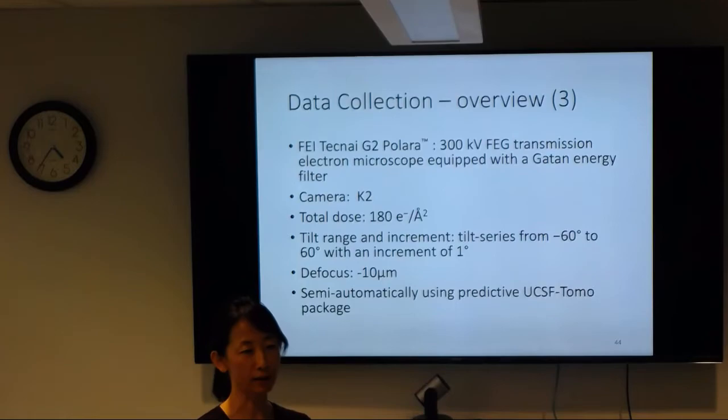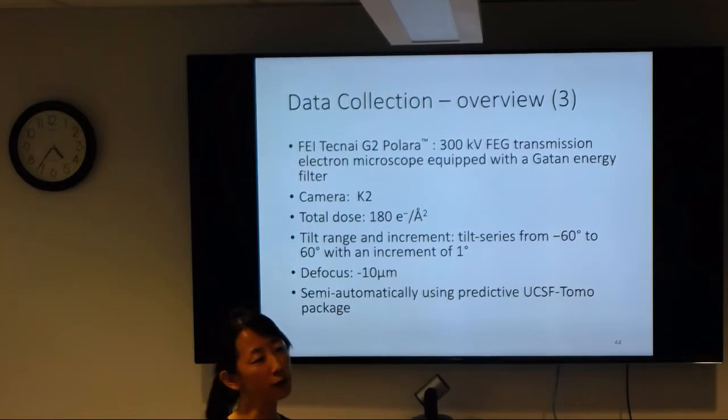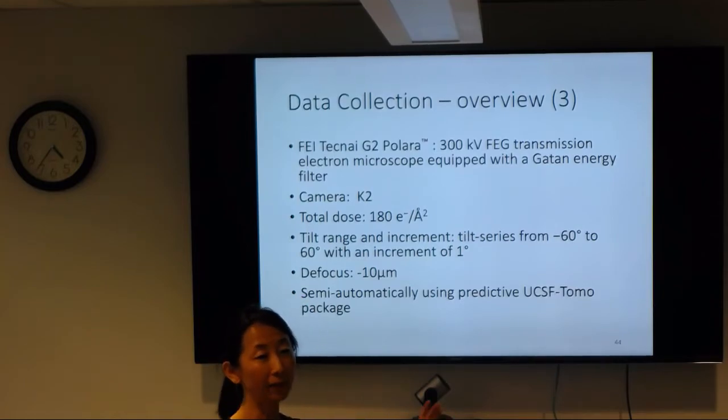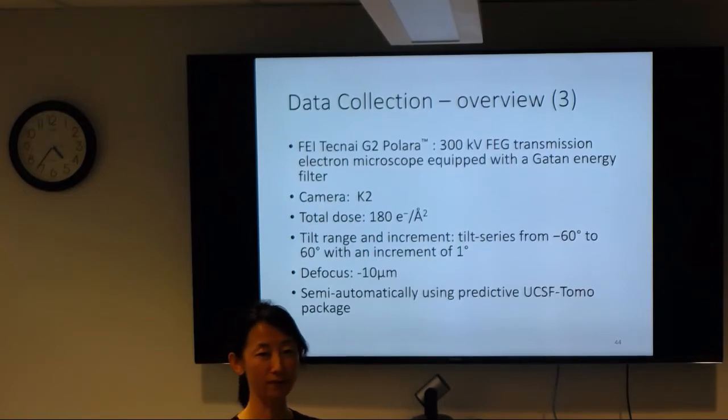So defocus is another factor you have to consider. This is the same principle as in cryo-EM single particle: you want contrast or you want resolution. Here, they want to make sure they see everything clearly, so they use a relatively higher defocus. -10 is pretty high.